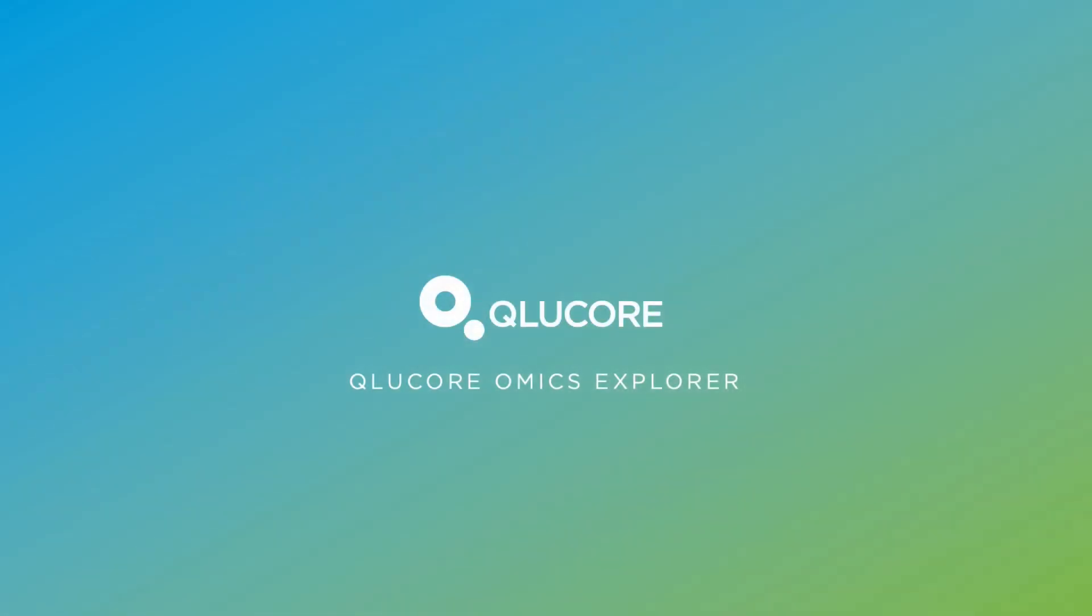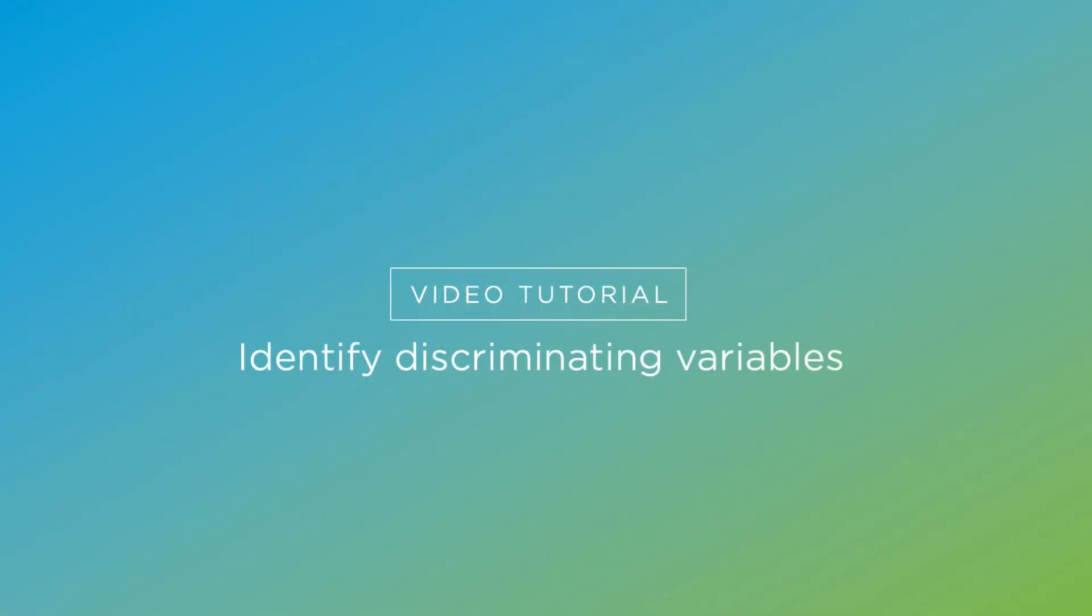Welcome to Qlucore Omics Explorer. In this tutorial, we will show you how to identify discriminating variables, visualize and save the results.